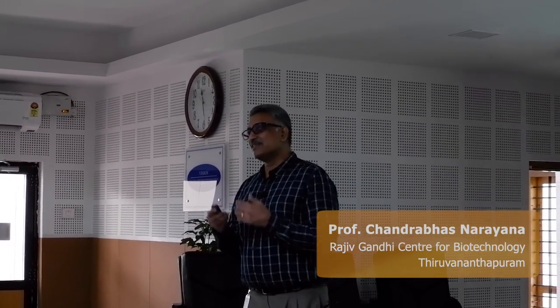Raman is a light-matter interaction. That means light is falling on a material, and light is interacting with the material, and that interaction is what causes the Raman effect.